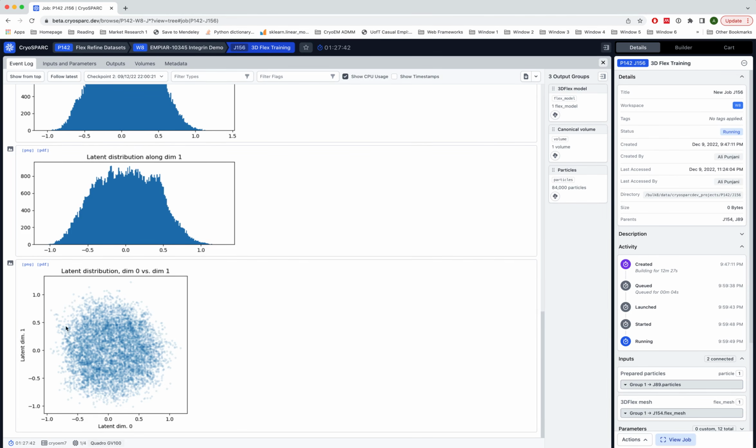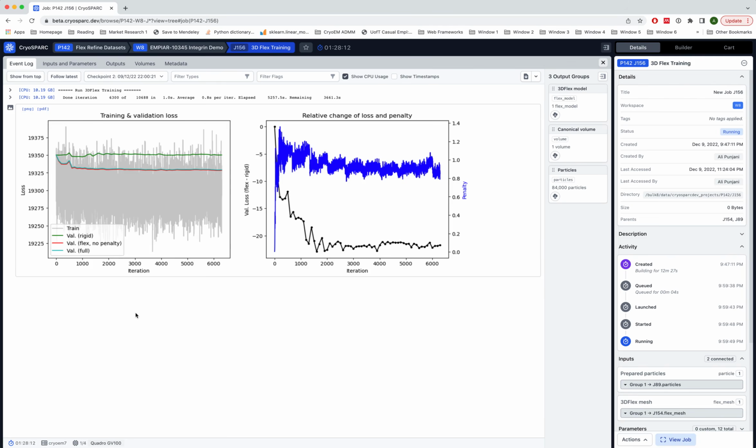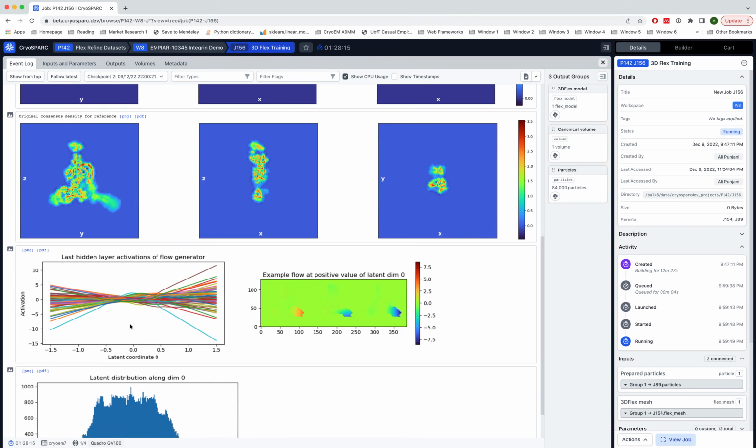What we see here is related to the parameter that we discussed earlier, which is the centering strength in the latent space. And that's a parameter that, as I mentioned, is a bit of a nuisance, but it needs to be tuned on a per dataset basis. And here we can see that it's tuned well because our latent variables are not too tightly centered around 0. They range in value from about -1 to +1, and they're not hitting the edges of our -1.5 to 1.5 range of latent estimation.